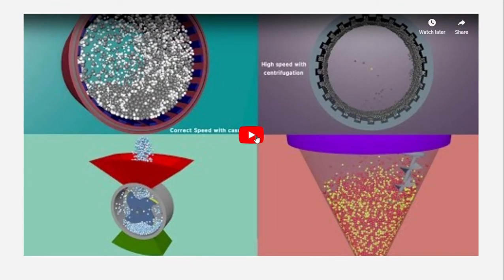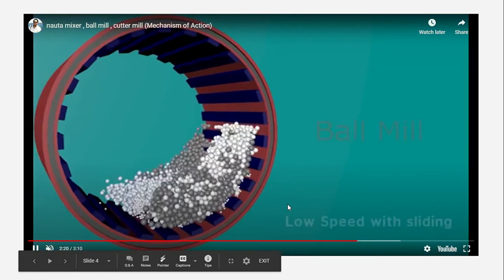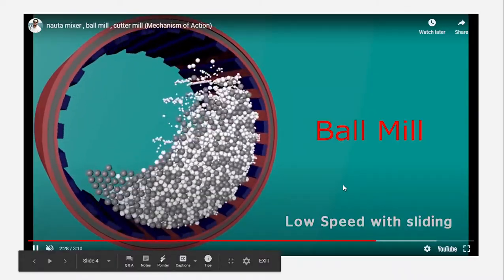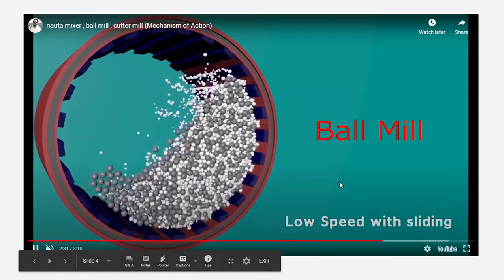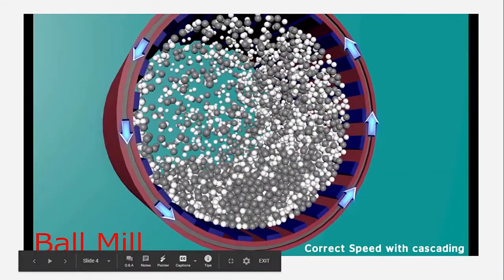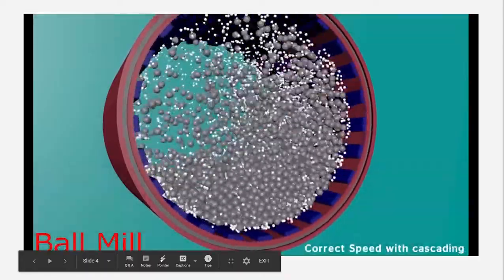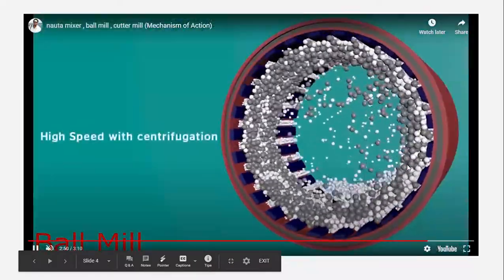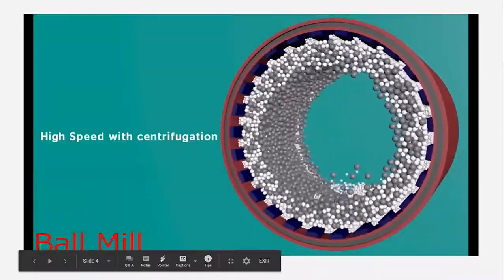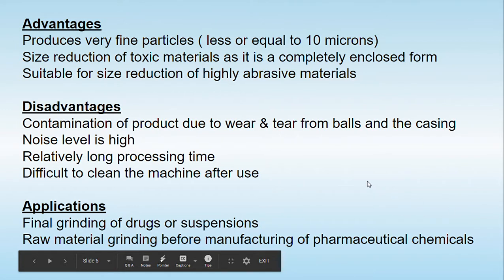Now let's understand the working of the ball mill through this video. When the ball mill is rotating at low speed, sliding takes place and no proper size reduction occurs. When rotated at the correct or optimum speed, the cascading effect is observed — you can see that balls of different diameters are present and they reduce the particles very effectively. However, if the entire cylinder rotates too fast, centrifugal force dominates and proper size reduction is not achieved.